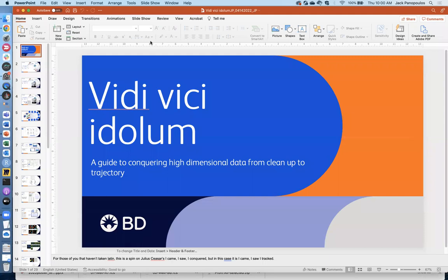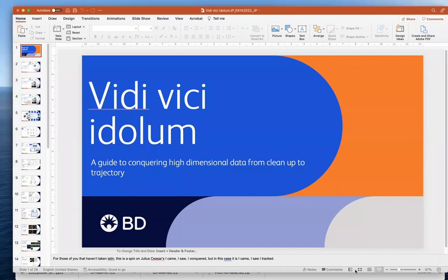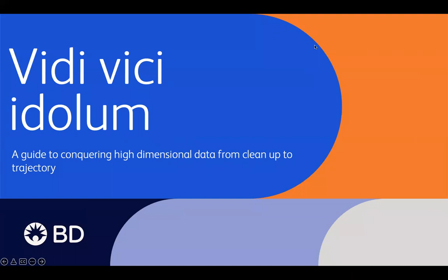I'm an application scientist for FlowJo at Vidi, and today we're going to be going over my AAI talk that I gave just over a week ago. So let me just put this in presentation mode so you guys can see the full screen. And then I'm going to try and choose a little laser pointer here so that you guys can see things as I point them out.